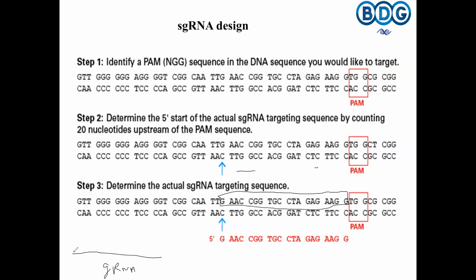So the guide RNA spacer sequence is taken from the region which it wants to target, and the remaining is the scaffold sequence, which is unique for the particular type of Cas9. So this is how people make it, very simple. But the only thing is, how do you know that this particular stretch that you selected is unique to this gene? It may be present in other genes also, as very similar sequences, maybe one or two nucleotides different.